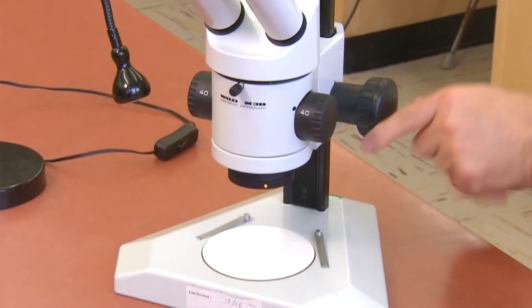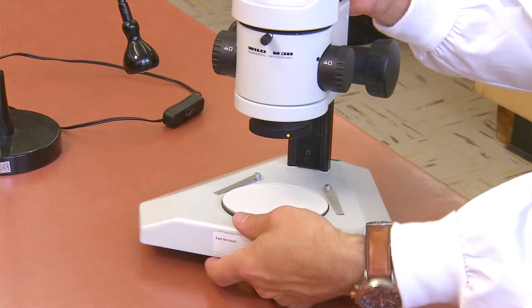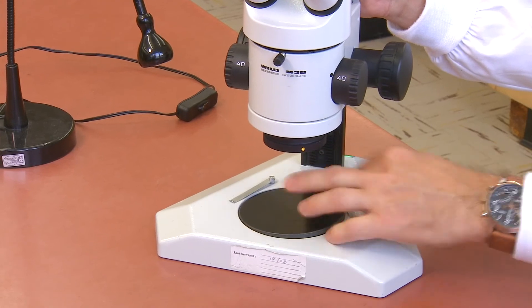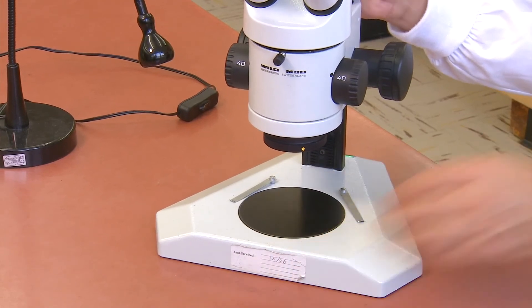In the base, you will notice a stage plate. This disc is black on one side and white on the other, and it can be flipped over depending on what kind of specimen you are looking at and what background you would like.